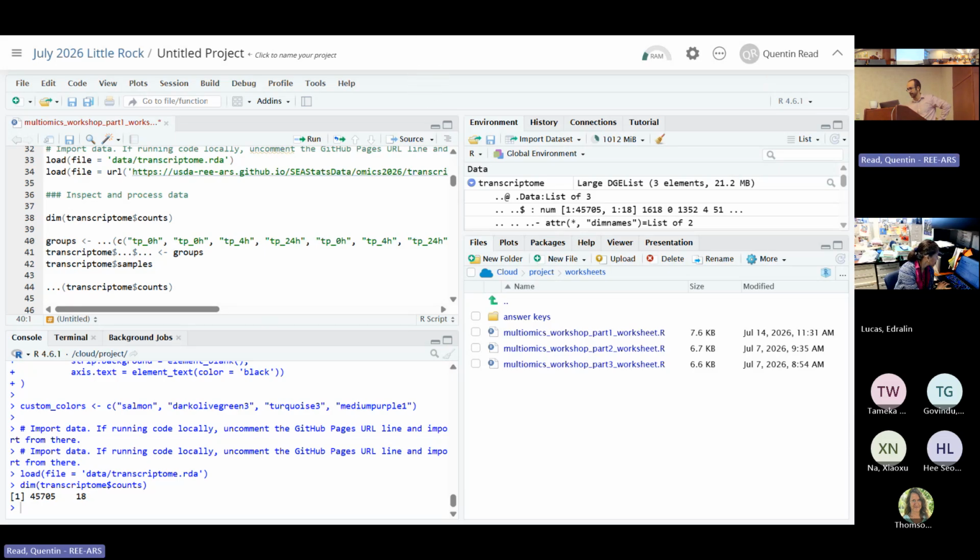If you use this locally, then you have to install the packages, right? First. That's right. Yes, so I set up the RStudio environment on the demo server to have the packages pre-installed and all the data there and stuff. But you wouldn't have that if you were doing it on your own.